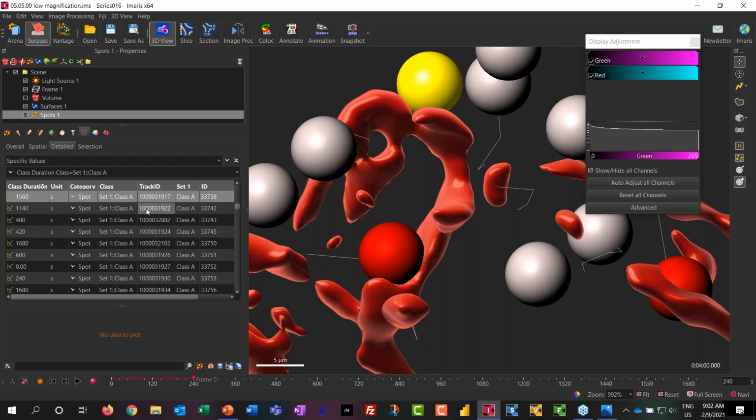Any other questions? I think for the recurring question, this was most of this. I think the other question was about the histogram and the resolution of the x-axis, the space between them. So can you adjust it?